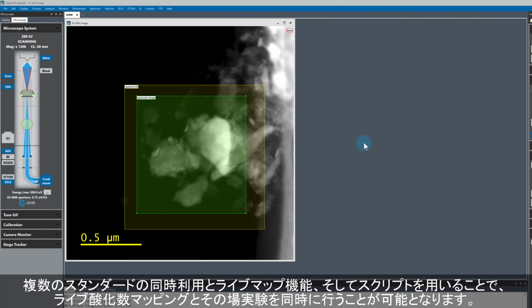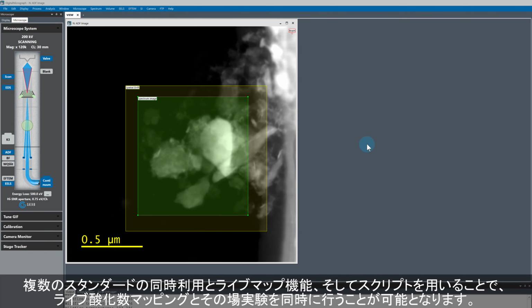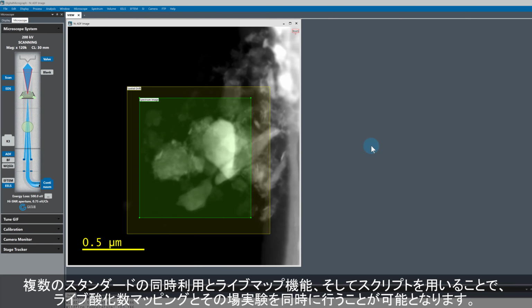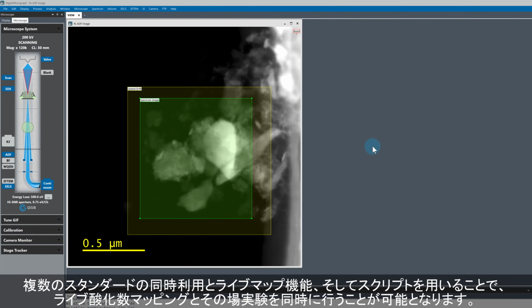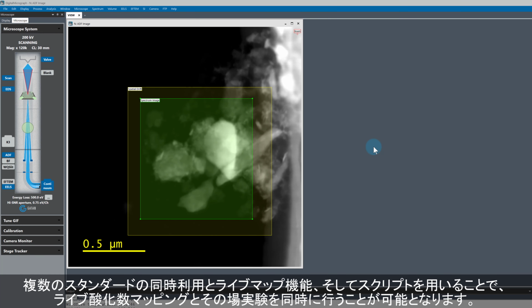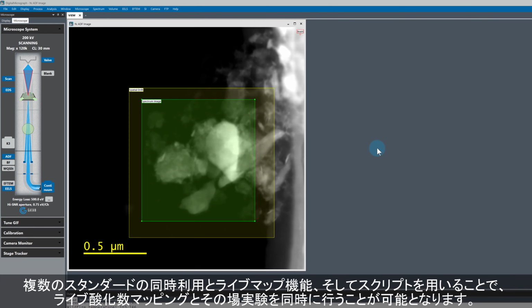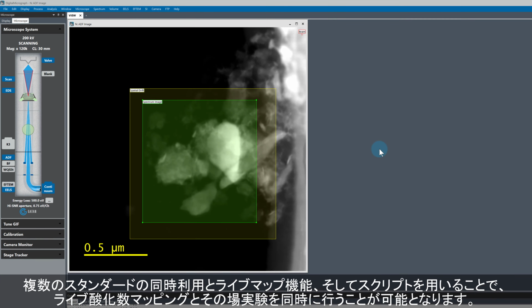The microscope I'm using is a JEOL F200. I'm running the experiment at 200 kV and using a short camera length, which gives an optimized collection angle for EELS in the spectrometer. I'm using the second lowest energy dispersion of 0.75 eV per channel and the large high SNR aperture, which is a good filter setup for fast mapping in the Continuum.